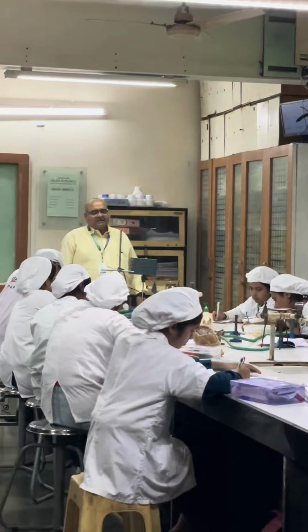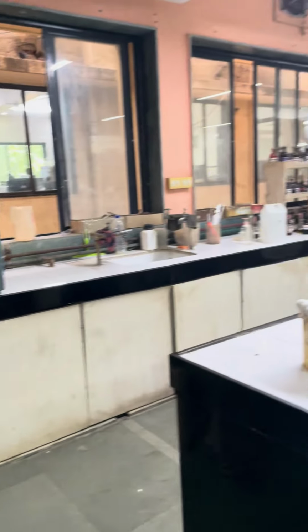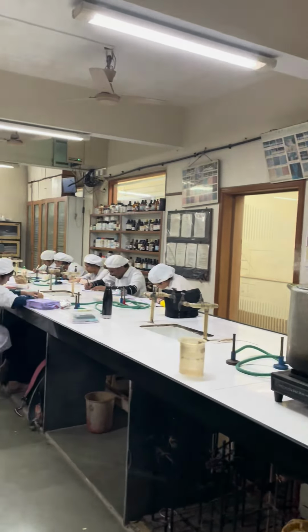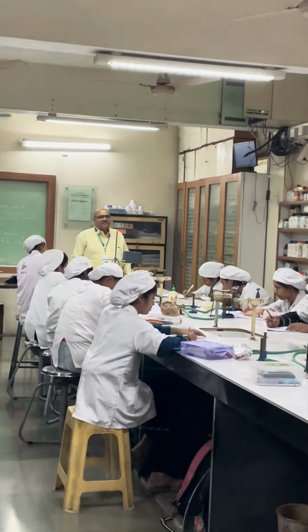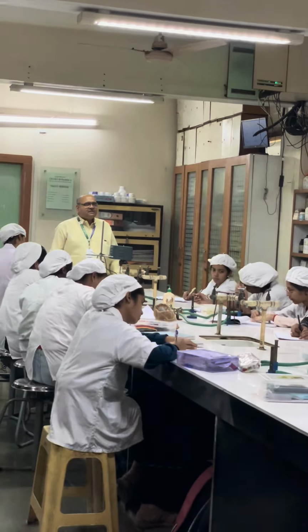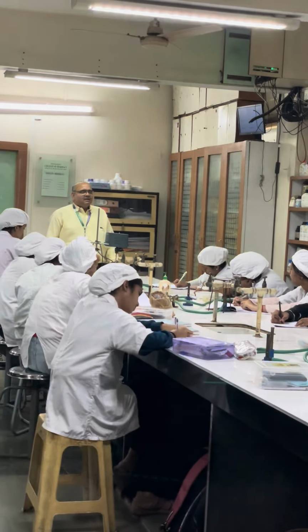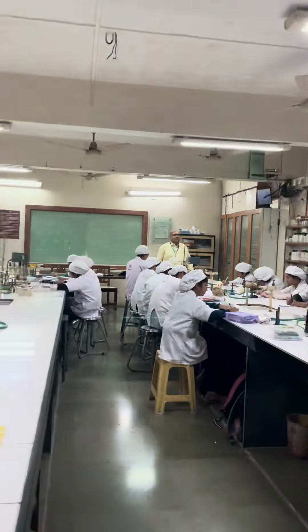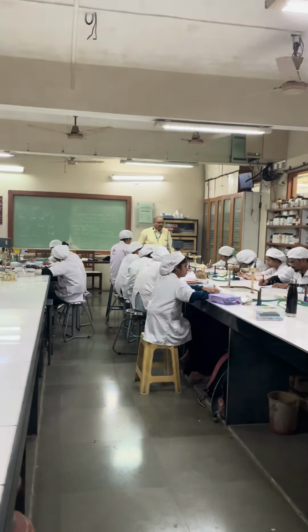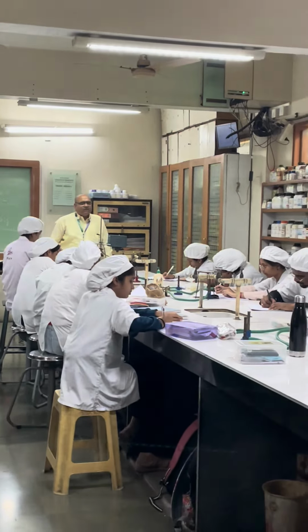and another one, that is lactose fermentation broth. The tryptone broth will show presence of indole on addition of Kovac's reagent, and the lactose broth will again show acid and gas production after 48 hours incubation. Or an alternative method is that this lactose broth is incubated at 42 to 44 degrees.